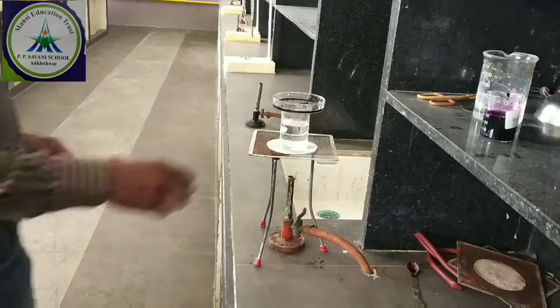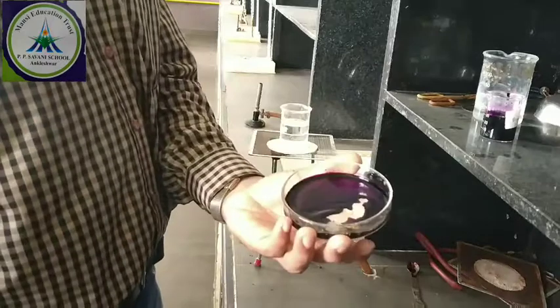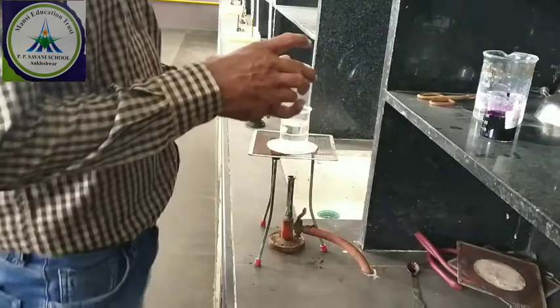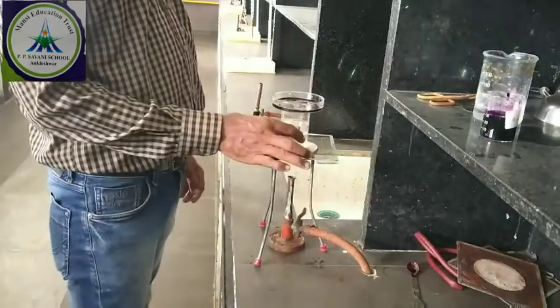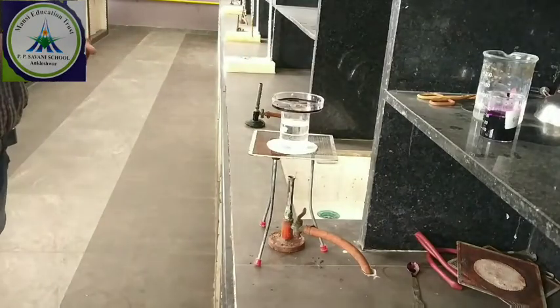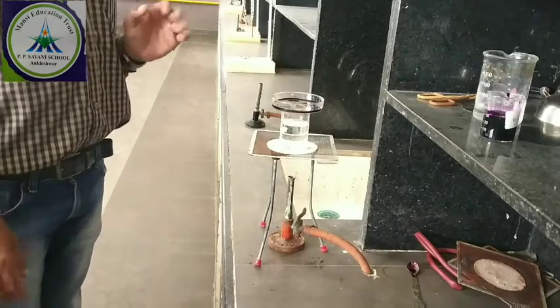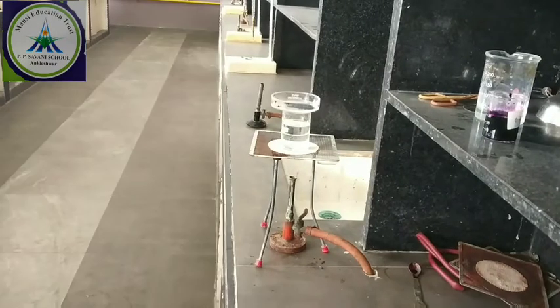First the dye or ink is in liquid form, and we heat it. When we light the burner, the water will evaporate, and after a few minutes, if you heat it, the solvent from the ink will vaporize and residue will be obtained.